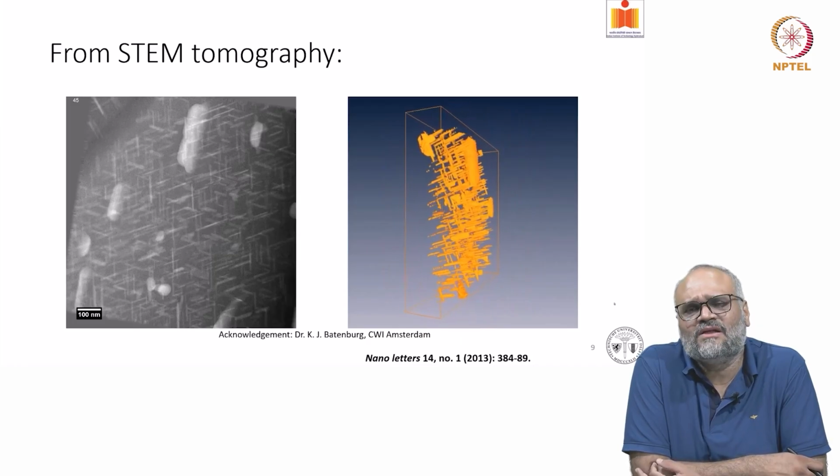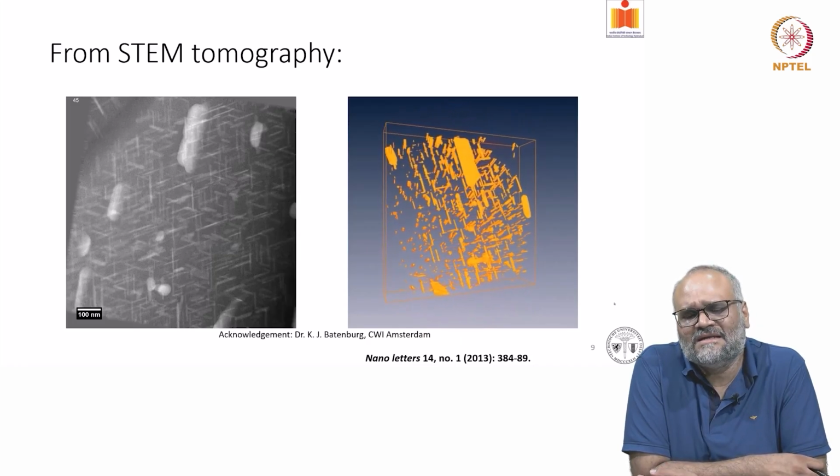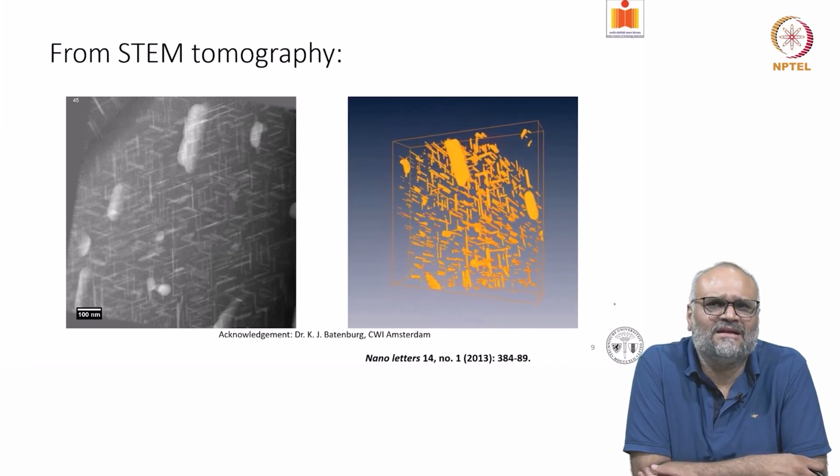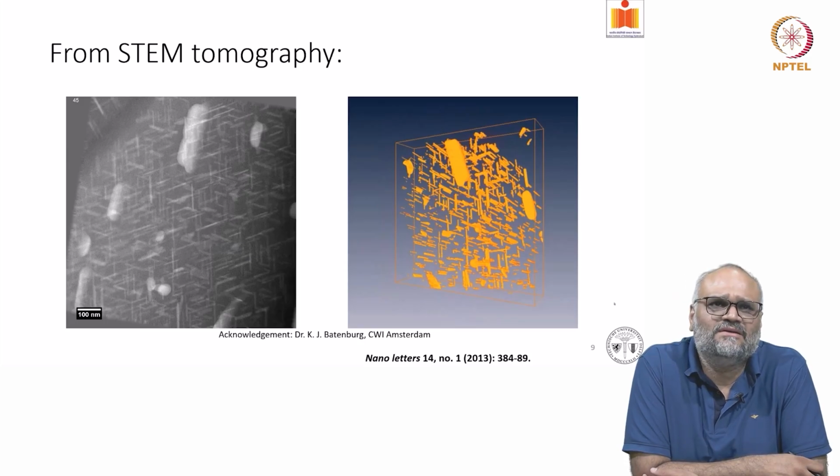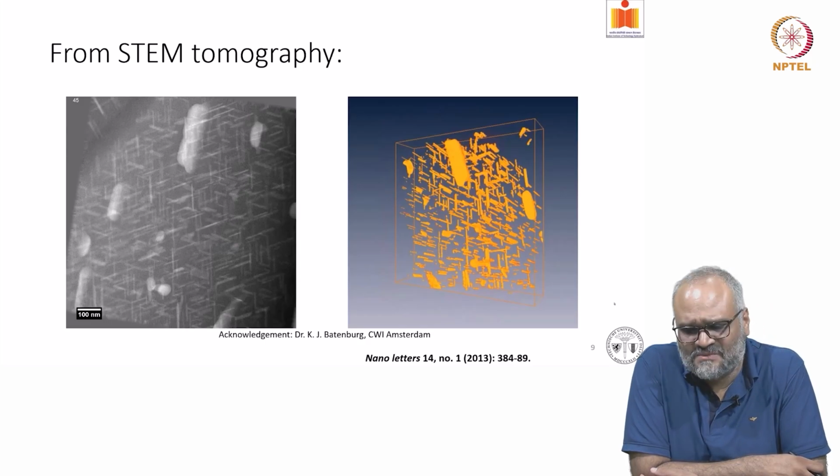usually when you are looking at heating or these kind of processes in a transmission electron microscope, we know that the thickness of the specimen is typically less than 100 nanometers. And when the thicknesses are so low, your surface effects are more predominant. And when you heat, there is a greater chance that the precipitation actually happens on the surface.